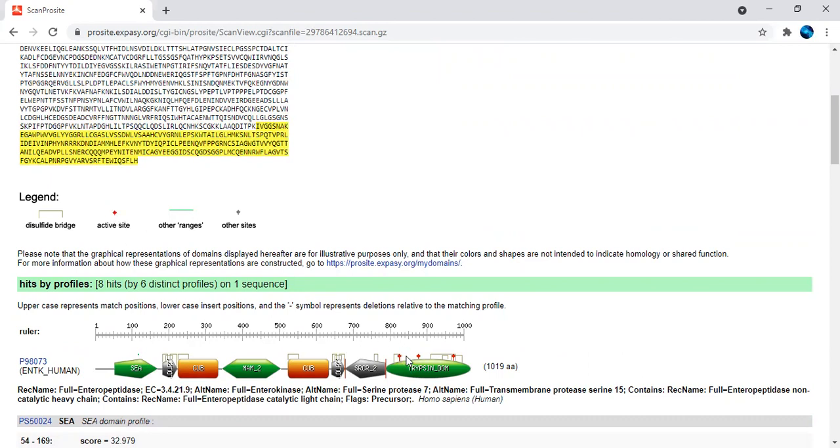These are the active sites in the protein. Whenever you go ahead with a molecular docking study, this is the most important thing you need, because we have to know the active site in our particular protein's 3D structure. This will help us perform the molecular docking at that particular active site.